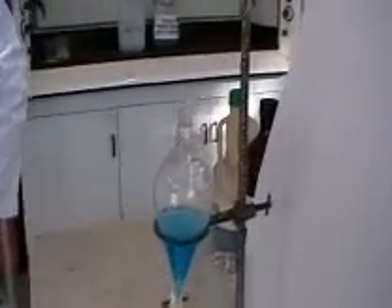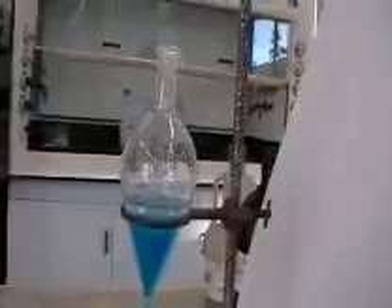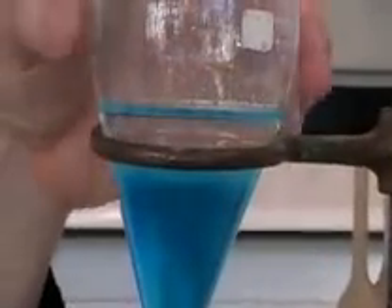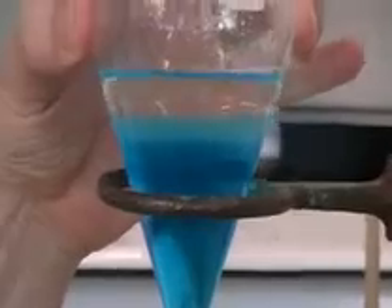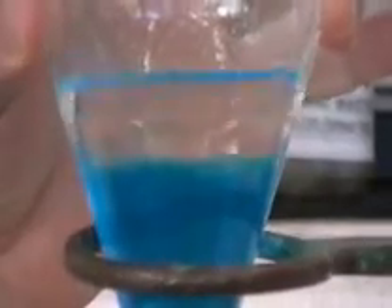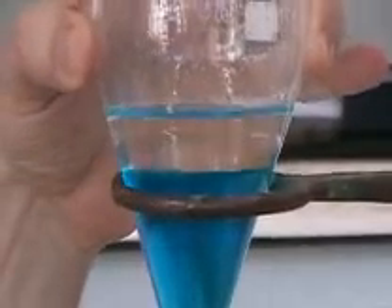What you do now is let the layers separate, and it's a good idea to crouch down at this point and have a good look at them, because it's going to take a little while for the layers to separate out. You can see there we've got bubbles that have formed — it takes a little while for those to dissolve back into their respective layers, and you get a nice crisp line.